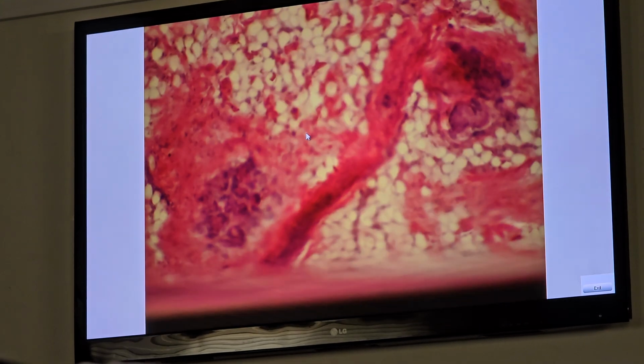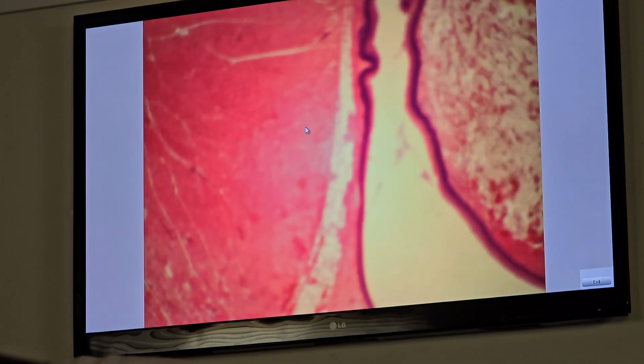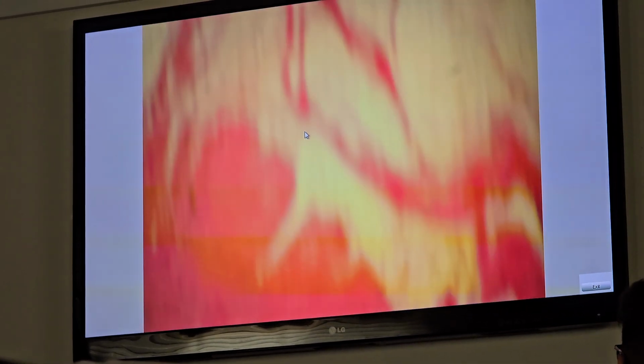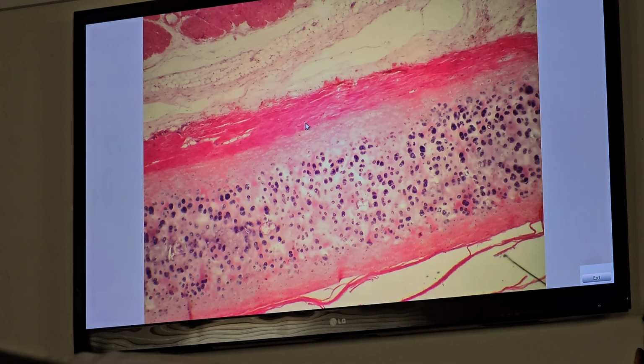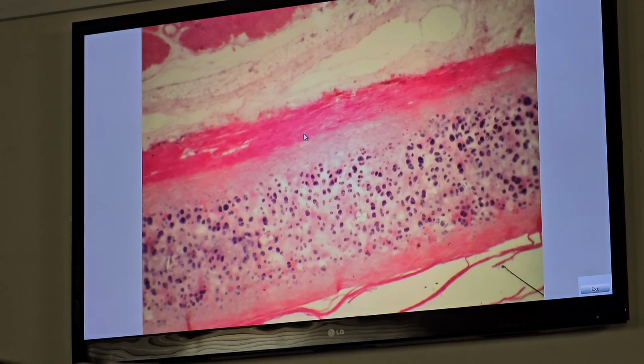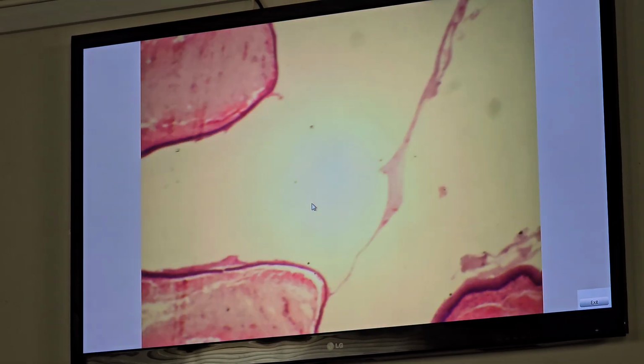Second part, the section in the larynx. The larynx is a short passage of air between the pharynx and the trachea. The wall of the larynx is reinforced by hyaline cartilage and small elastic cartilage, all of which are connected by ligaments. This is hyaline cartilage.